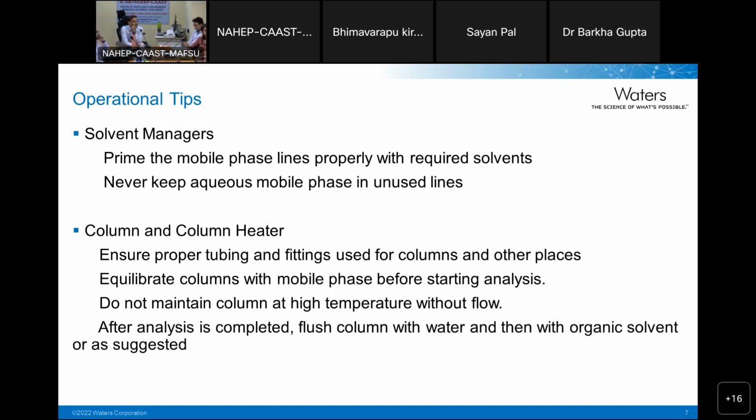After the analysis is completed, flush the column with water and then organic solvent, or as suggested by the manufacturer. But in general, what we say is flush the column with water to remove all the additives and then finally store the column in organic solvents. Again, always store columns in organic solvents, or again as suggested by the manufacturer.